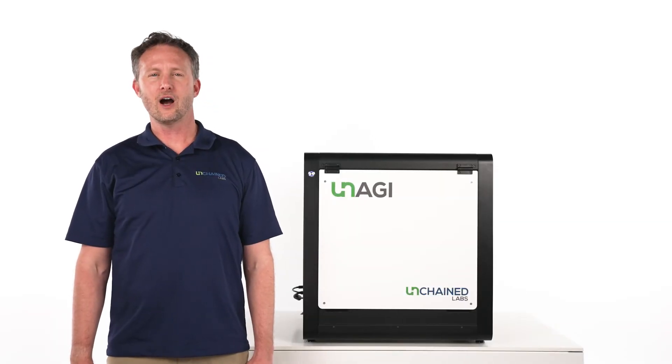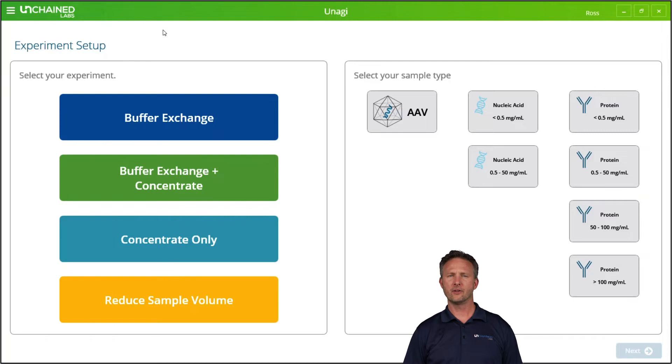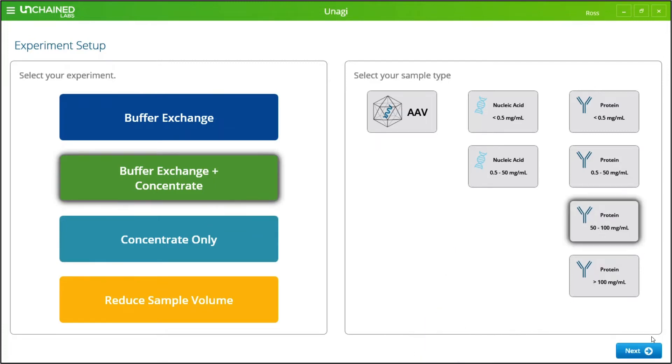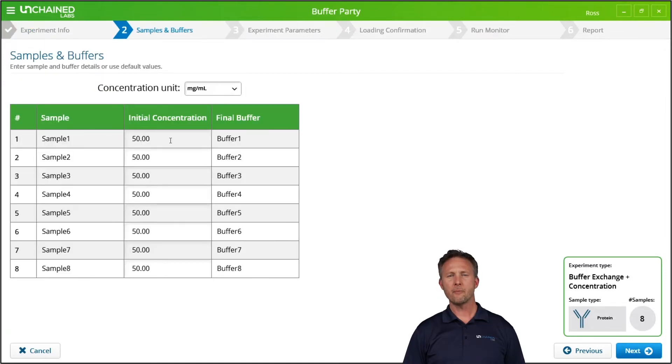Let's dive into Unagi's software to see how easy it is to kick off a run. Unagi's software is so easy to use, anyone in the lab can walk up and feel like an expert. Here is the opening menu where you select the application and biomolecule type — a single click sets the number of samples you have. Unagi automatically fills in all your samples and buffers for you.